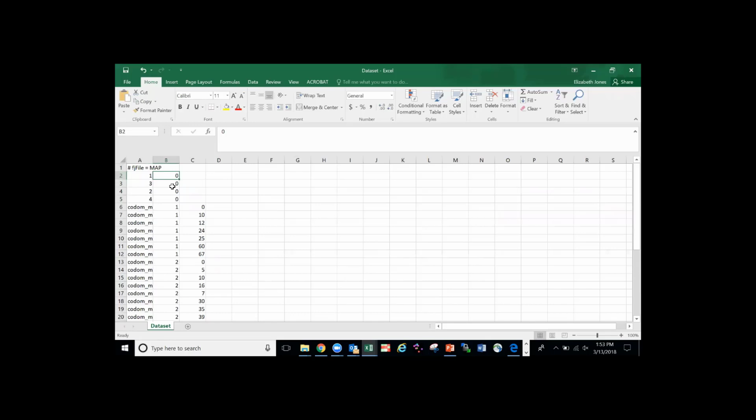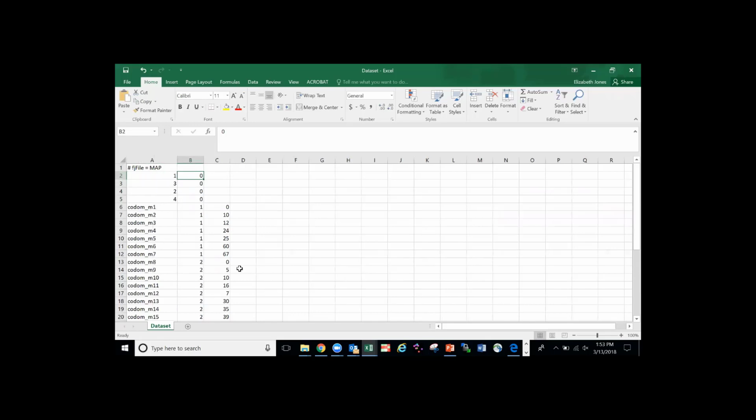So it'll do a percentage of the QTL that you have in the recurrent parent. And then all I have are my markers and the positions on the map. If you don't have positions on the map, it doesn't matter. Flapjack will just assign random positions for you, and it will import them in order.